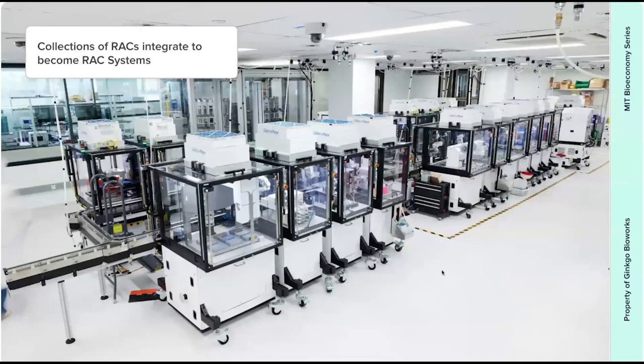And then in-house, we have a fairly large system that we continue to add to and refine, where we're able to run a large library of services for sequencing prep, for setting up digital PCR, RNA sequencing, cell cultures, where we're able to use our in-house software to interleave different protocols so that we're making the most efficient use out of this hardware as possible in the footprint of our lab space, in truly a walkaway manner for many of these protocols.